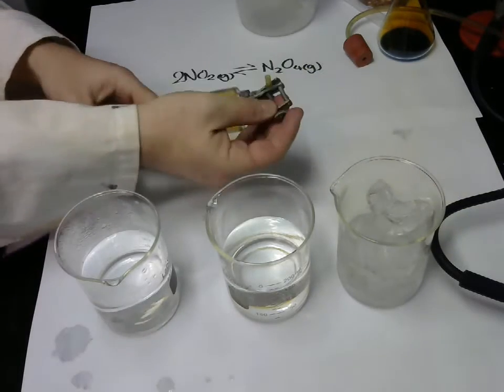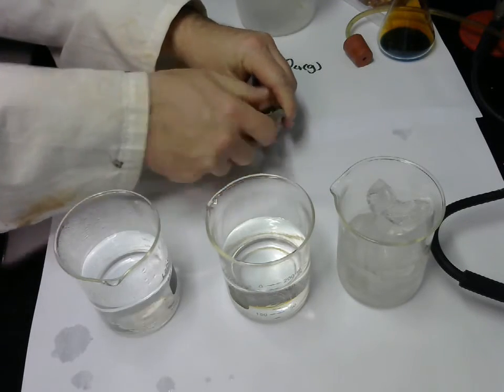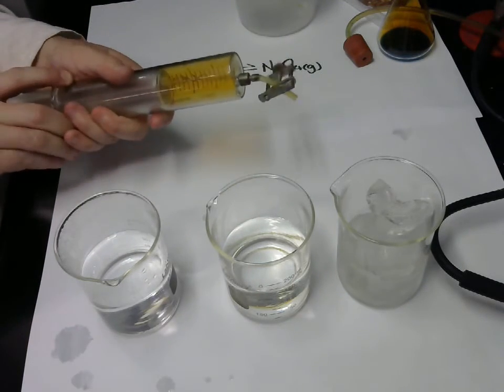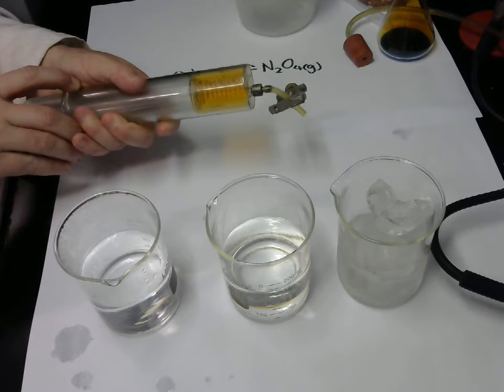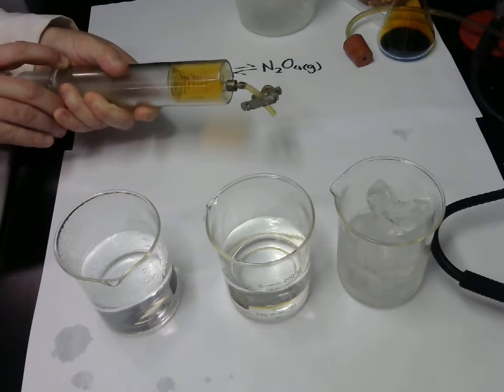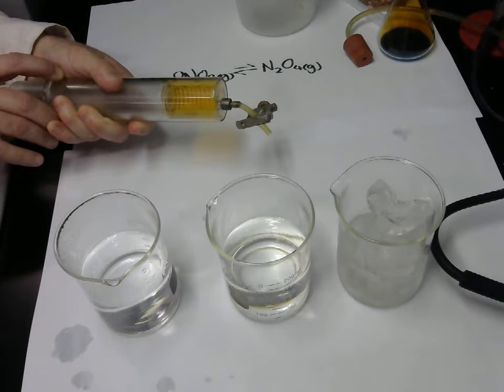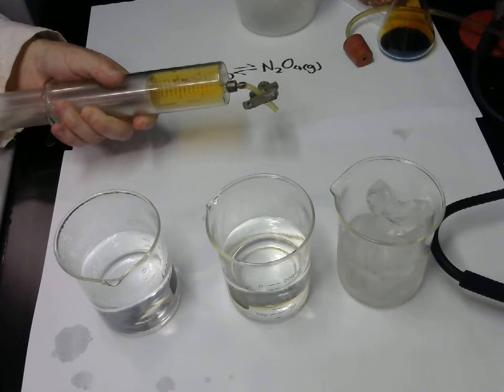I'm going to tighten that a bit, so it's not so loose. Okay. So of course it's got a bit darker, and then while I'm holding it, you guys that can see the screen can probably see it better. What's happened to it? It started to do what? Do it again. Just let it reset.